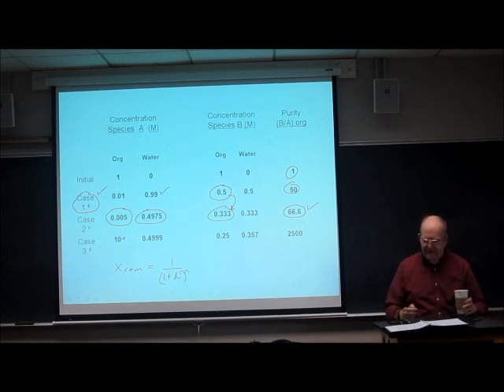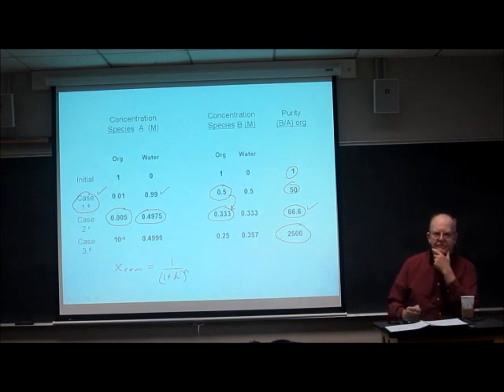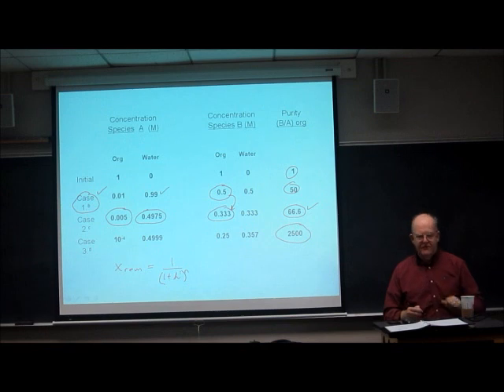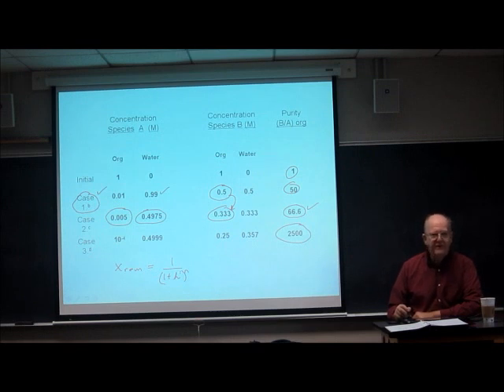Now, here's the really cool thing, if you get excited about stuff like this. Look at the purification factor now for B. That's big. So by doing the fancy two-step extraction, you really get a humongous improvement in your purification.